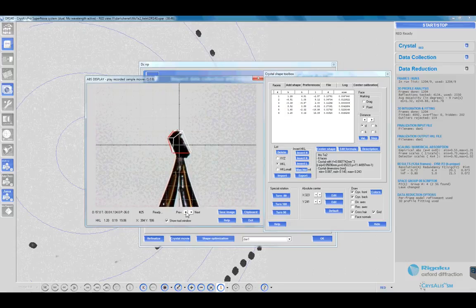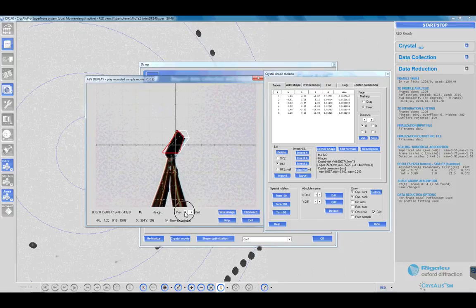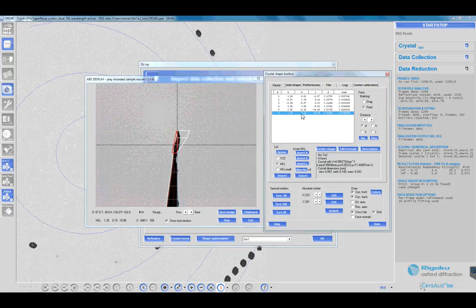This one looks like it is just about parallel to the big flat face of the crystal. Big flat faces almost always will have small whole number indices. Other facets, it can be hit or miss, but the big flat ones almost always are there for a reason. So we'll go to this face. We'll check what the indices are right now.